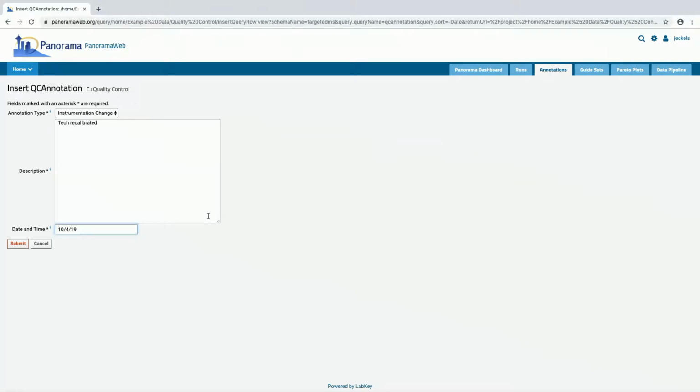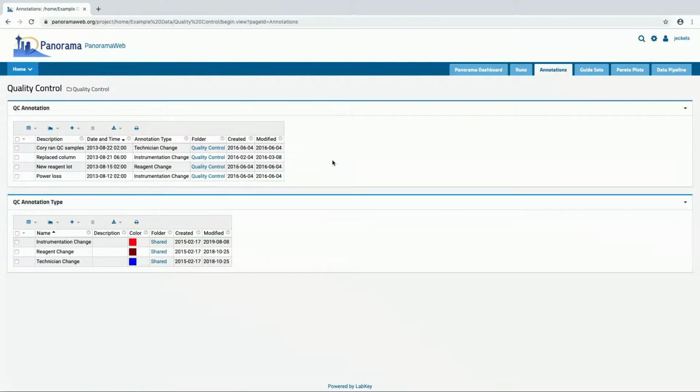So really, it's a pretty simple feed. This could, of course, be populated by any of the import mechanisms in ETL or anything like that if we have something that would be interesting to automatically annotate. But so far, these have been more manual. No, I physically did something to the instrument. It's out of the ordinary, and so it's something that folks have just typed in like this.